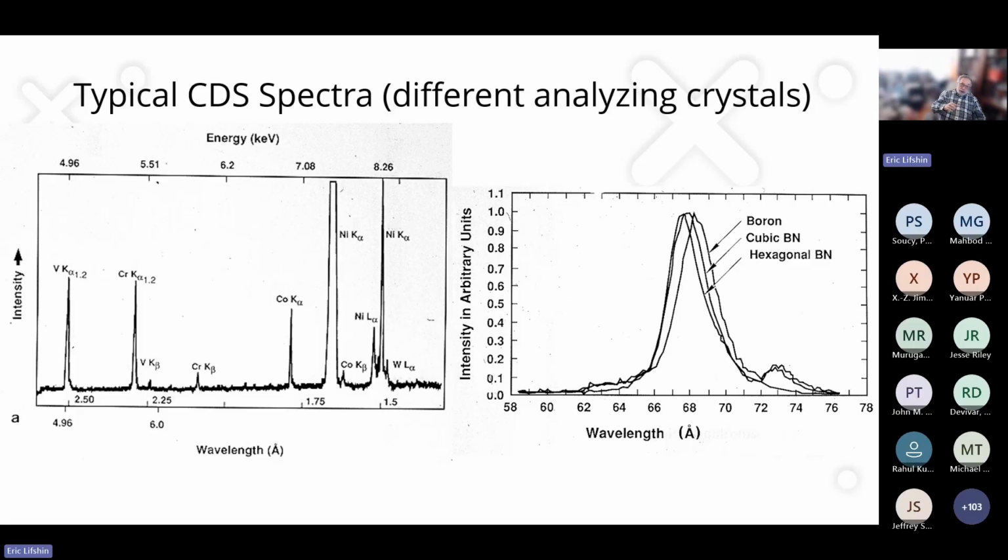If I want to look at longer wavelengths, which are associated with lighter elements, because the electrons are not as tightly bonded to the nucleus, then I need a larger crystal. I can only get up to about 10 angstroms with a natural crystal. So people started developing lead stearate, multilayers, and eventually used semiconductor techniques to build what they call layered synthetic microstructures, which allowed you to look at fairly long wavelengths.